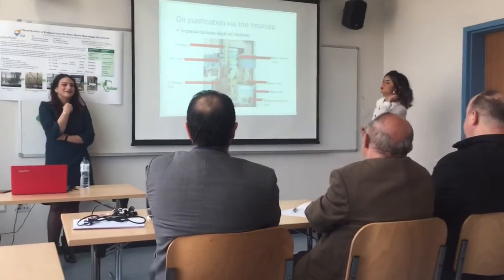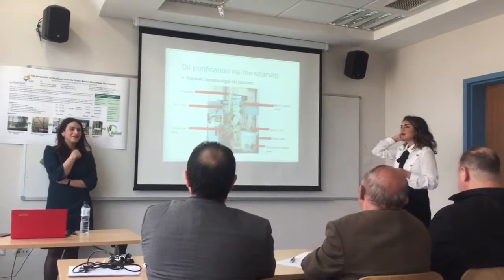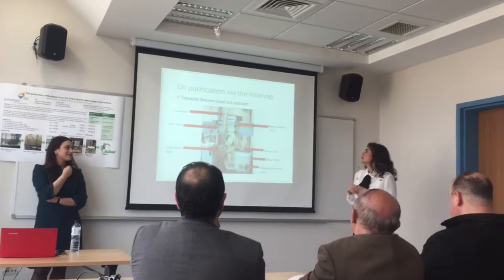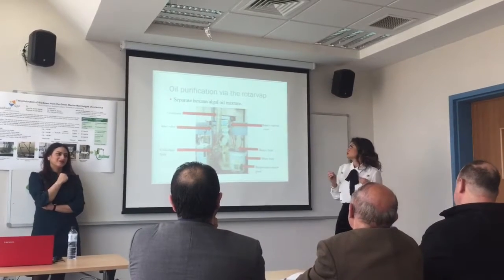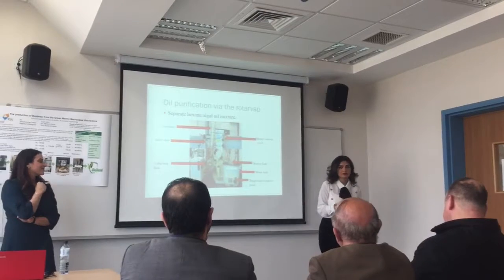So the next step after the extraction has been completed, now we need to separate N-hexane from the algae oil. To do so, we used a rotary evaporator. A rotary evaporator is a device that separates solvents from our samples using evaporation.